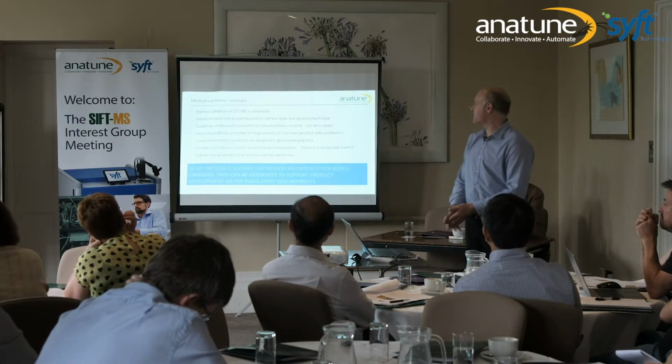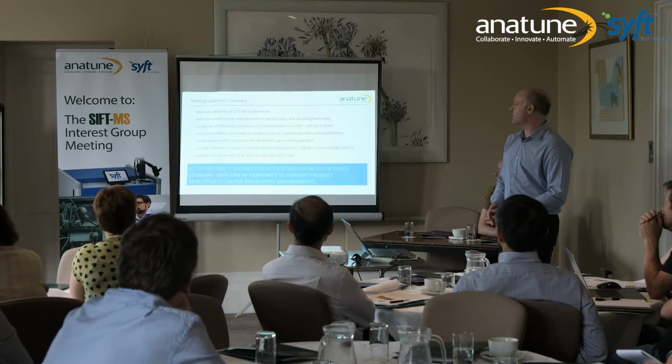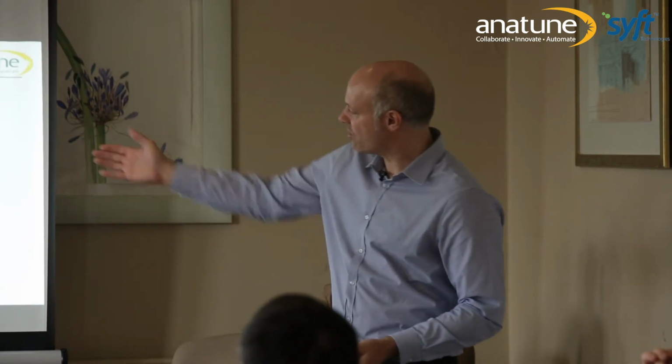So just to summarise, or put Joe's summary in, method validation on SIFT-MS is achievable following the ICH guidelines, but modifying them to your needs for your method. And there are some considerations such as what is a blank, how do you do your LODs, but as long as we think about what we're doing and define what we're doing, we can actually get through a method validation. That's Joe at Intertech, so I'd like to thank Joe for that. He doesn't work there anymore, unfortunately, but nonetheless, it's all his data and it's all his work, and it's a very good piece of work.